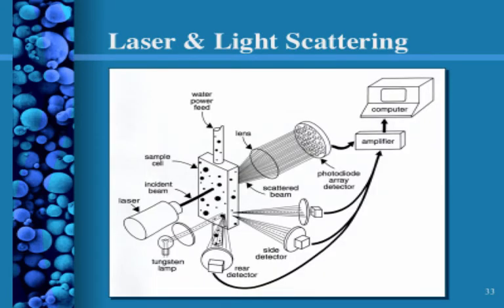And then there are different parameters. You have a laser beam that goes through the stream of particles. You have multiple detectors in different regions, and so you can get a feel, because if it is platelets and they're all oriented along the edge, it's going to let most of the light through, but you need the opposite direction of the plate.